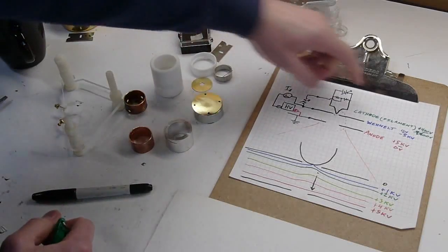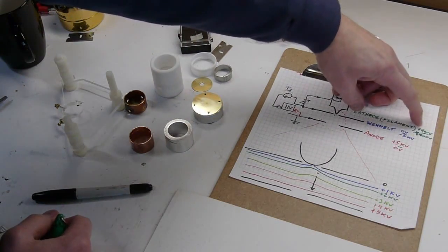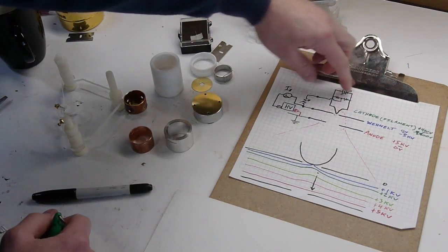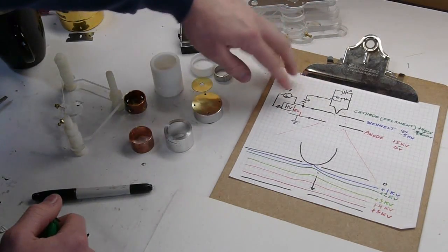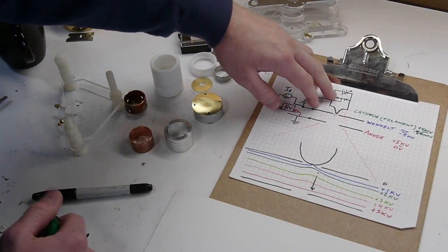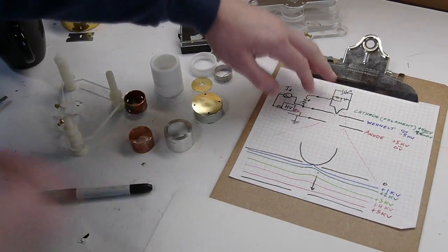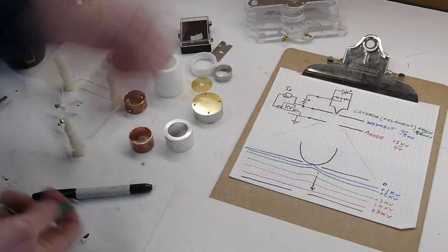Okay, sorry about that guys. I corrected an error here. This is actually supposed to be positive. The filament ends up becoming more positive in potential relative to the rest of the system. And the reason for that is, as it's boiling off electrons, think of getting rid of a negative charge. It's actually going to end up more positive.